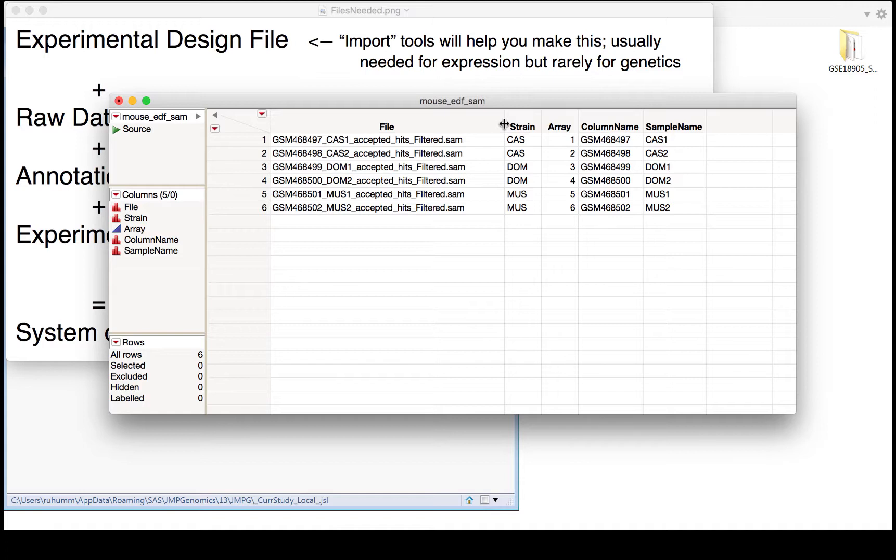The strain is a grouping variable. Array is a required column giving each unique sample a unique ID number. Column name is naming which sample is in each file, and the sample name is a more meaningful label to use to refer to each sample in the analysis output. When you create this file, this experimental design file, be sure to save it as a SAS file type, so a .sas7bdat file extension, so that you don't run into errors later on. It's always a good practice to save this as a SAS file extension.